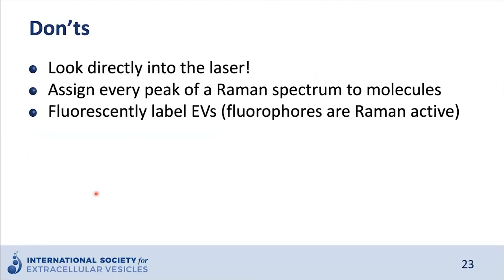Some dos: definitely consider the substrate — we normally prefer quartz over glass due to its low intrinsic autofluorescence at typical wavelengths. We always keep the laser power and integration time fixed across samples to ensure accurate comparison. We perform and report daily wavelength and intensity calibrations using material reference standards and lamp standards. We use dilution series to optimize EV concentration, especially for single trapping, to avoid multiple EVs trapped at the same time when you think you're getting just one. Some don'ts: don't look directly into the laser and consider proper laser safety. We recommend to avoid overfitting of data — trying to fit every little peak to a defined molecule without proper calibration — and always consider that fluorescent labels can confound Raman measurements, as these molecules also show up in spectra.